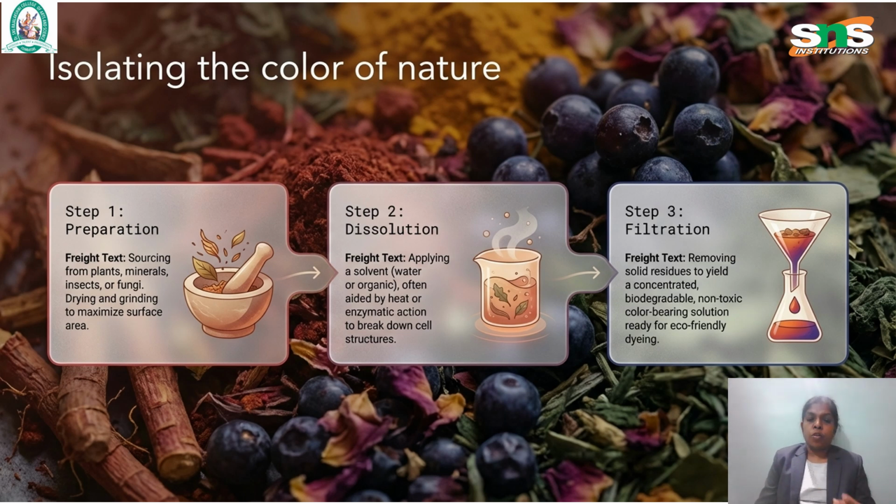It can be water or any organic solvent like ethanol, acetone, etc. And then comes the filtration. Here the solvent is also filtered and it can be reused. The color-bearing solution is used as the dye solution.